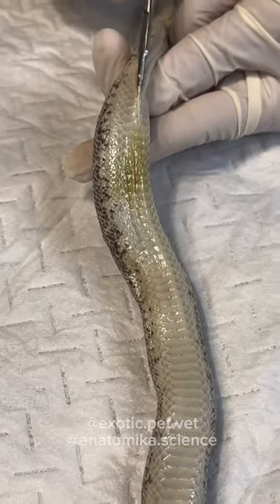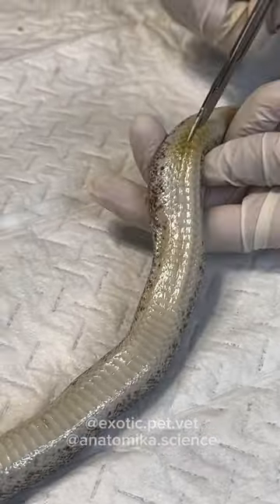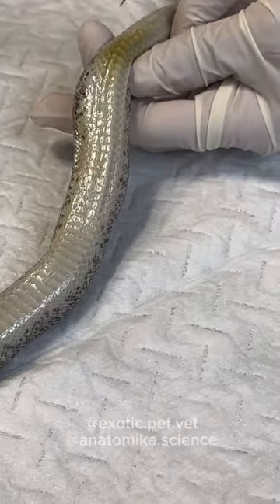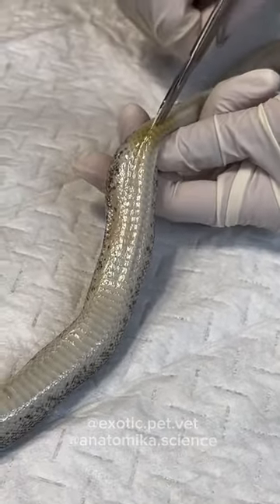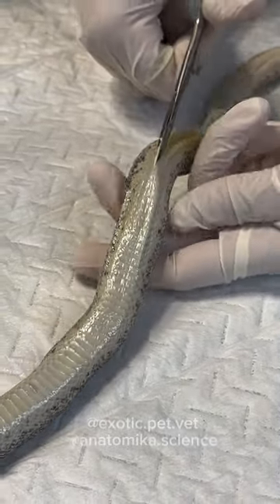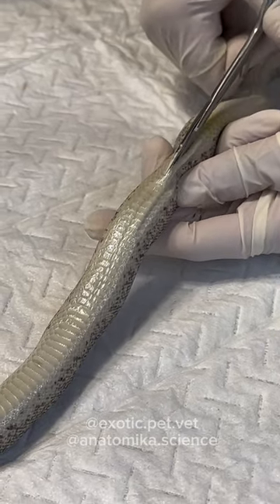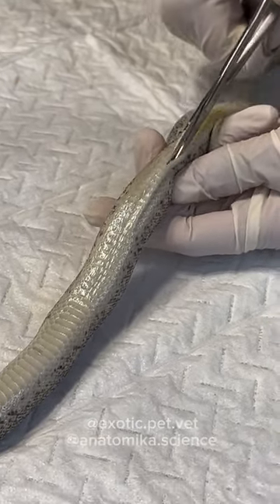Oh okay. I was actually just thinking about this the other day — I've never worked on live animals, so I don't know what normal is. I have no idea what a normal, healthy animal looks like on the inside.